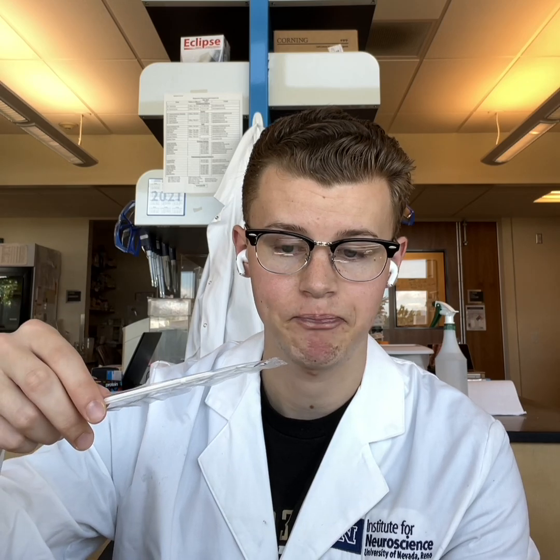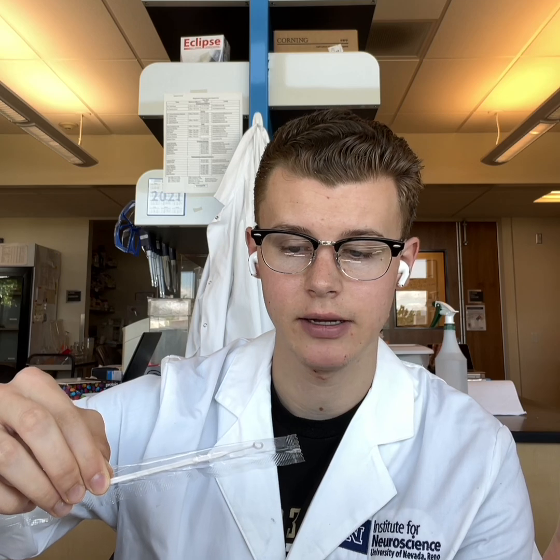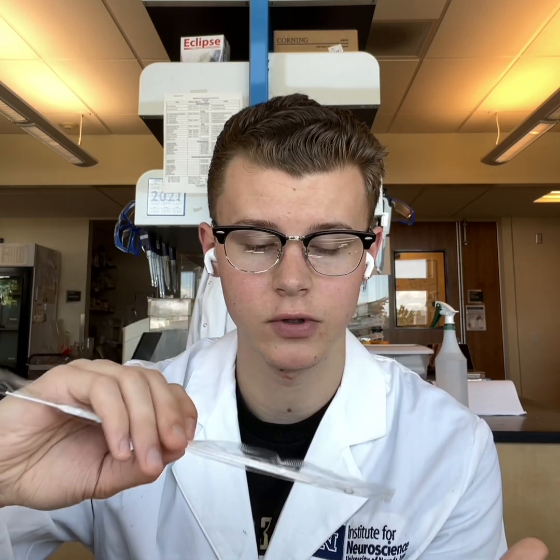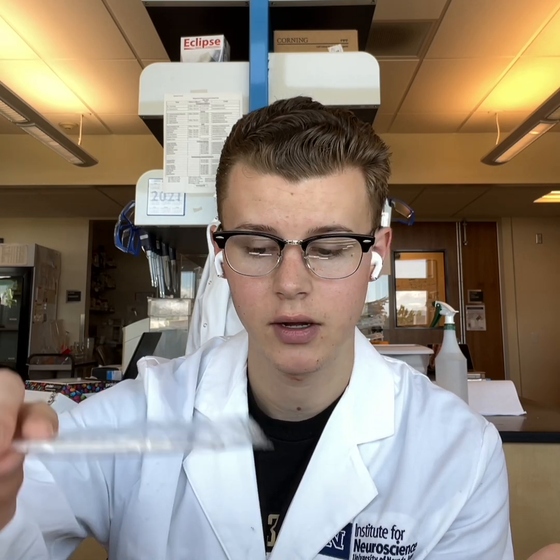You're going to do a streaking dilution method where you grab a loopful from the vial with your sterile, individually packaged inoculating loop. You're going to streak one quadrant of the plate, flip it over, run from that quadrant to another quadrant, and again from that quadrant to another quadrant. We aren't using Bunsen burners here. That's why you flip it over after the first streak, so that you get a more dilute streak with each quadrant.